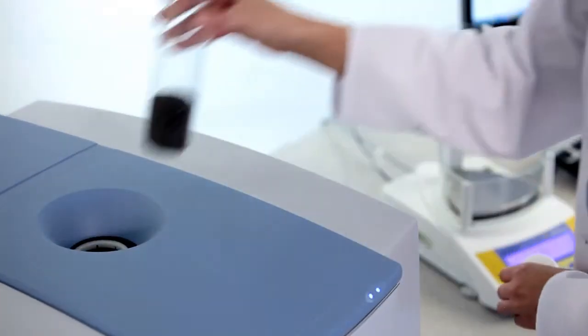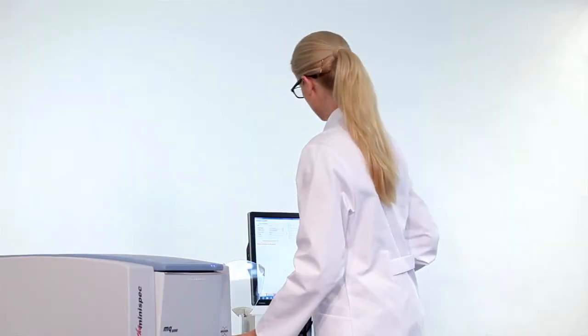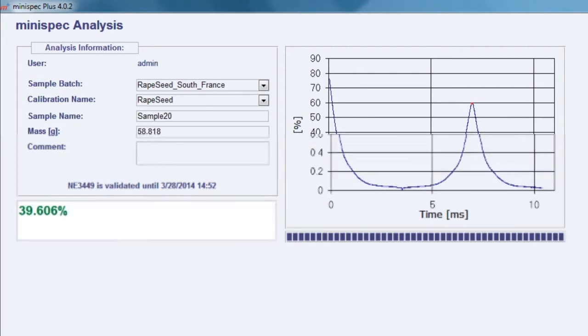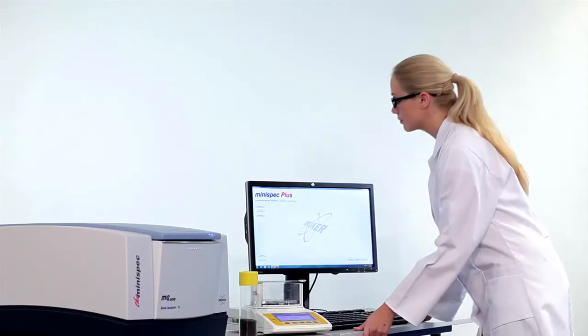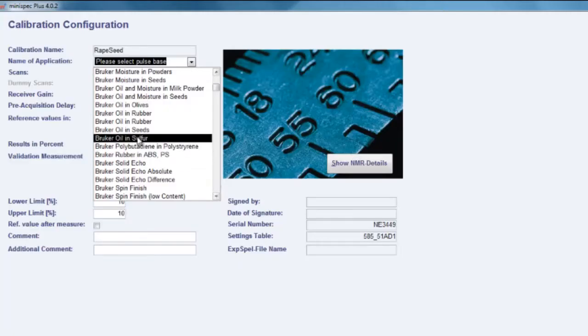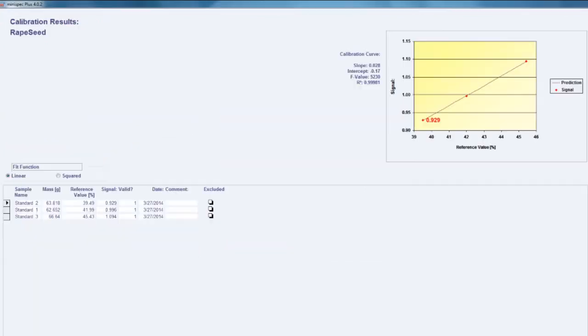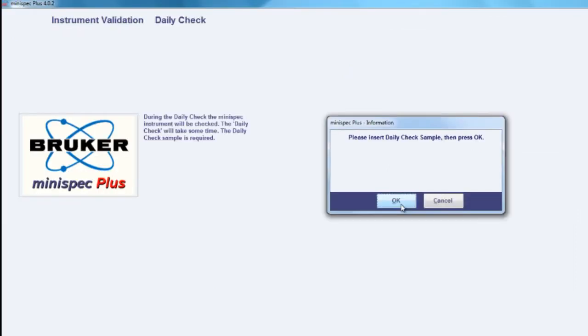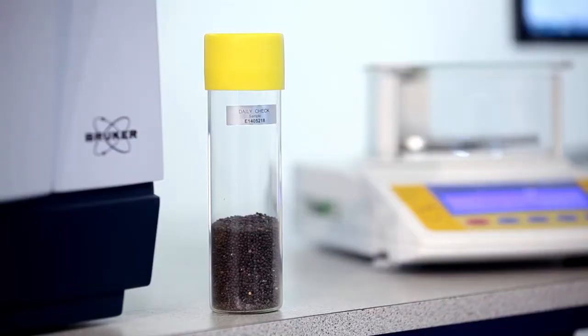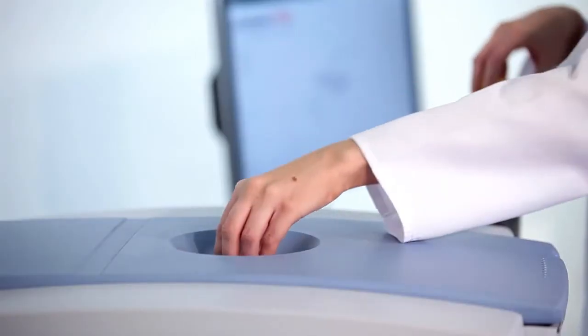The results are shown within seconds. Upon installation, the system is calibrated with three to five samples of the respective seeds. In this example, a set of three certified calibration standards for rape seeds were measured. Only once a day, the minispec is validated with Bruker's daily check sample.